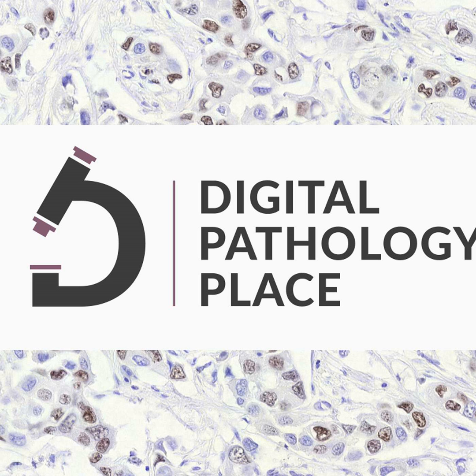Yeah, we're definitely hearing a lot of people talk about it at some conferences recently, like the CAP Data Summit. There's a lot of value in the data that pathology generates, not just synoptic report data, but all sorts of molecular and other data. It's super useful in precision medicine, for matching patients to trials, and for research. They're starting to acknowledge that and also want to use the value of that data to elevate the department a little bit too, which I think makes a lot of sense.